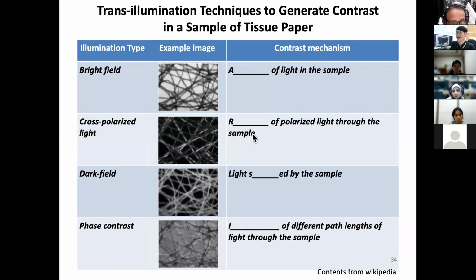How can you say that? Direction. Rotation. Yes, rotation. Somehow the sample rotates the polarization, which will actually be able to go through the next polarizer. So this is rotation.